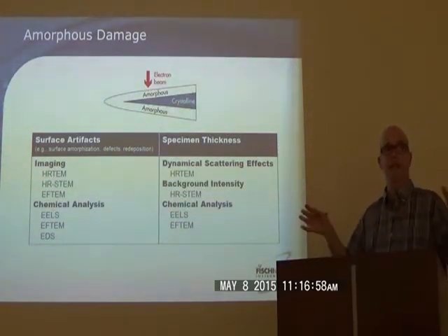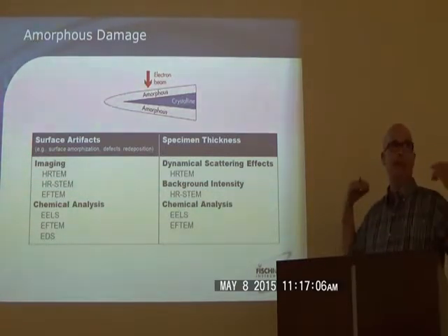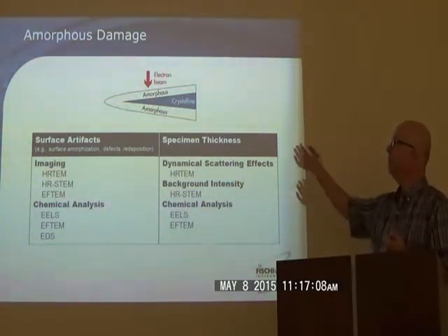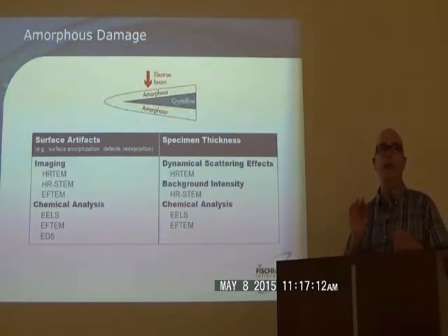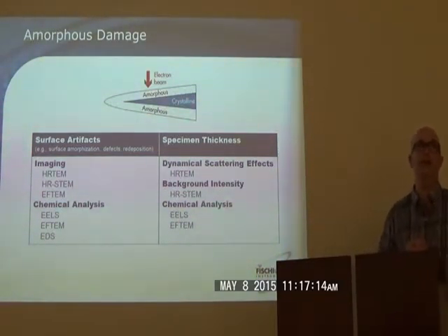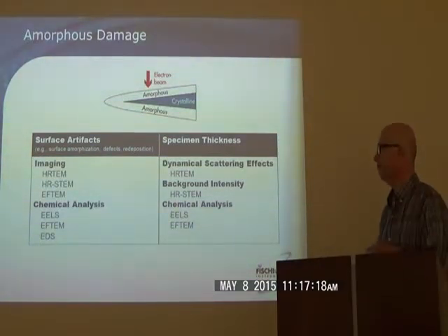And that's that bowl full of jelly layer that occurs right at the surface. So no matter what energy we use, no matter what angle we use, no matter what temperature we use, there's always going to be a little bit of something on a sample that's not good, but we hope to minimize it greatly by using proper application of technology.